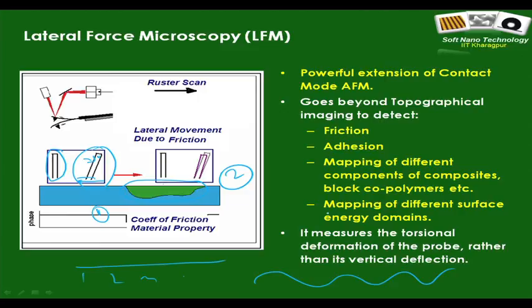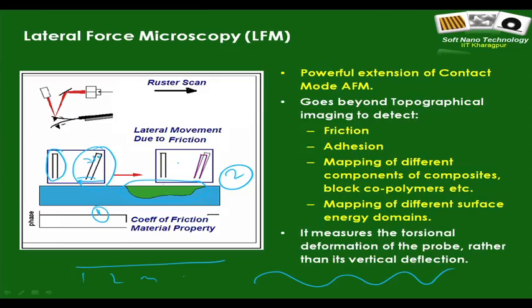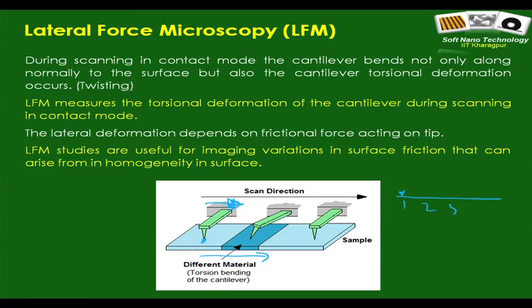By now, you have probably understood that scanning probe microscopes are all about finding out some sort of an error. So, you see here you can pick up an additional error, an additional difference in terms of the extent or the magnitude of the lateral displacement, and that is exactly what is shown here. For example, on this light blue patch, the image is not fully correct. One should have shown this to be also partially distorted, but that is something missed out.